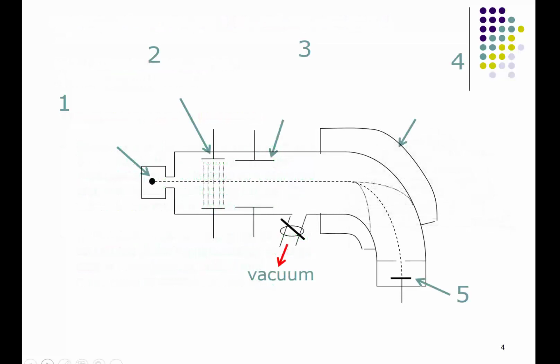This slide shows a diagram that outlines the basic functioning of a mass spectrometer. The applied sample must first be vaporized. That is, all the constituent atoms must be in the gaseous phase. This is true even for those elements that normally we think of as being solids or metallic at room temperature, such as lead or titanium.